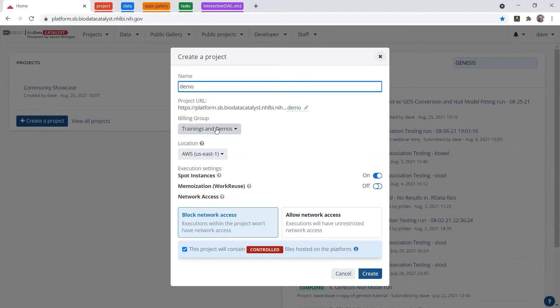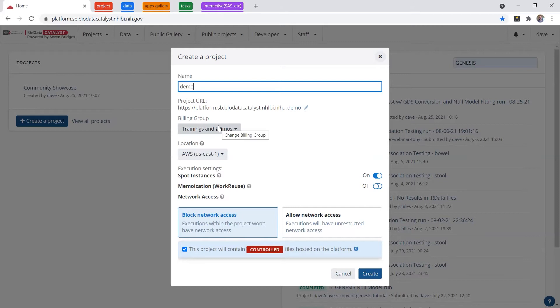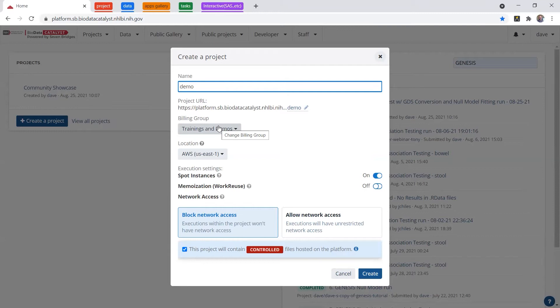Then you select a billing group. So I'm going to use the trainings and demos billing group, which Seven Bridges employees have access to. If you're a new user, you'll automatically have a pilot funding billing group. To get funds added to this billing group, you'll need to request those from NHLBI, and in the next section, Paul is going to go over just how you can do that.